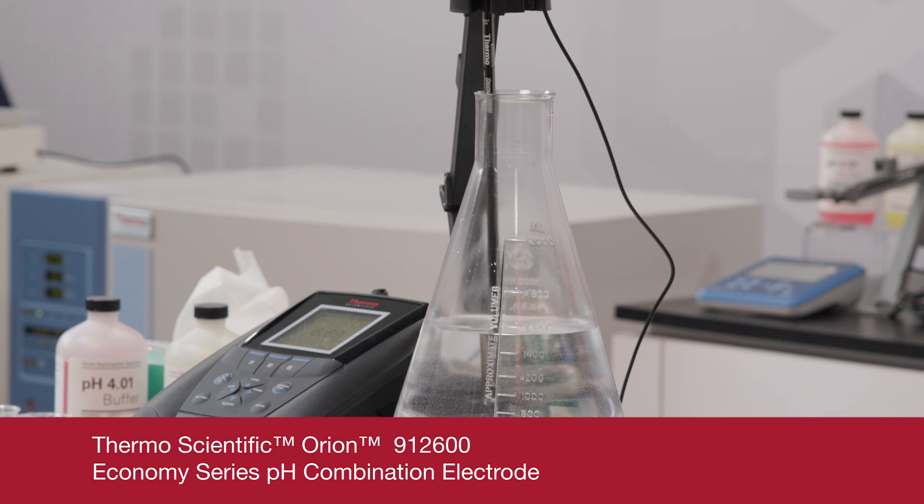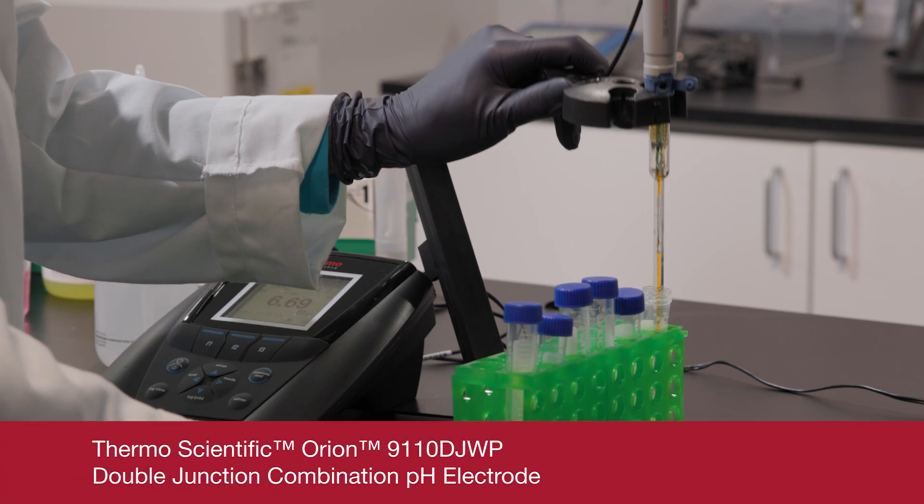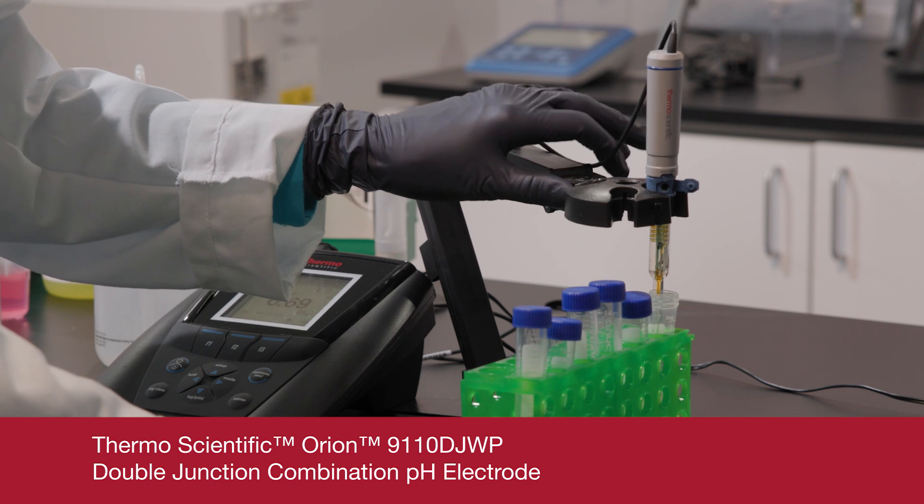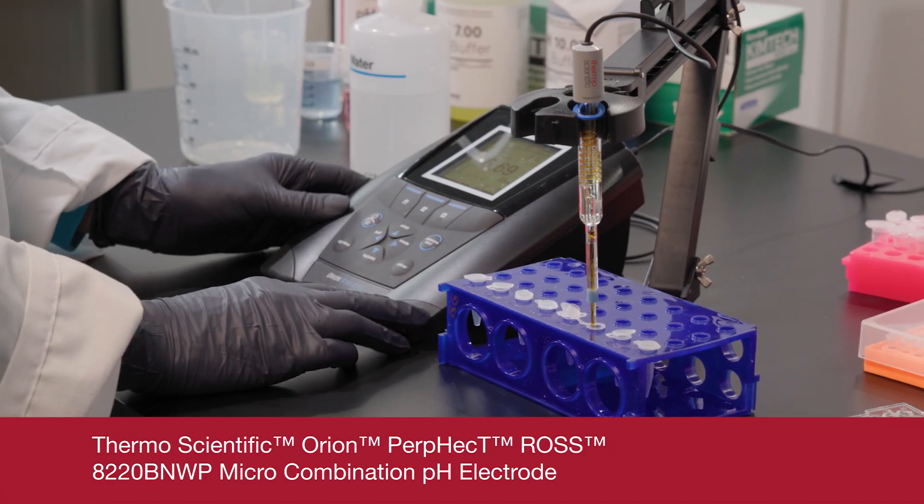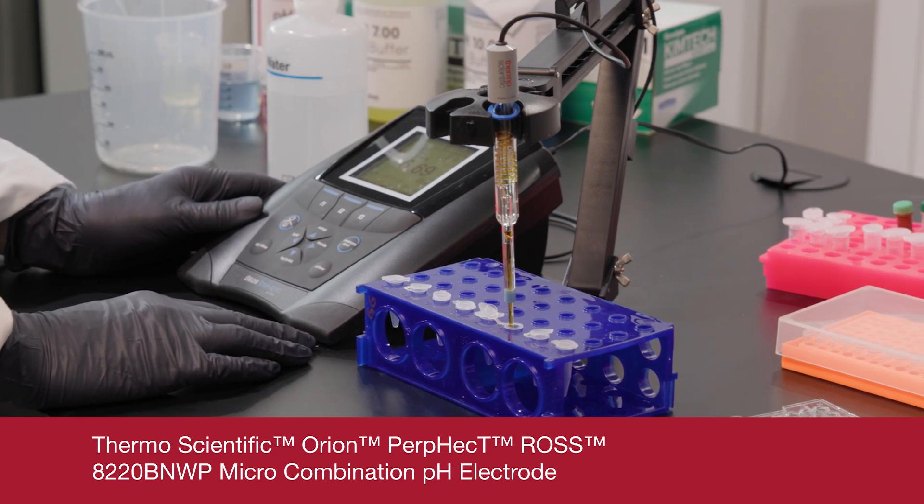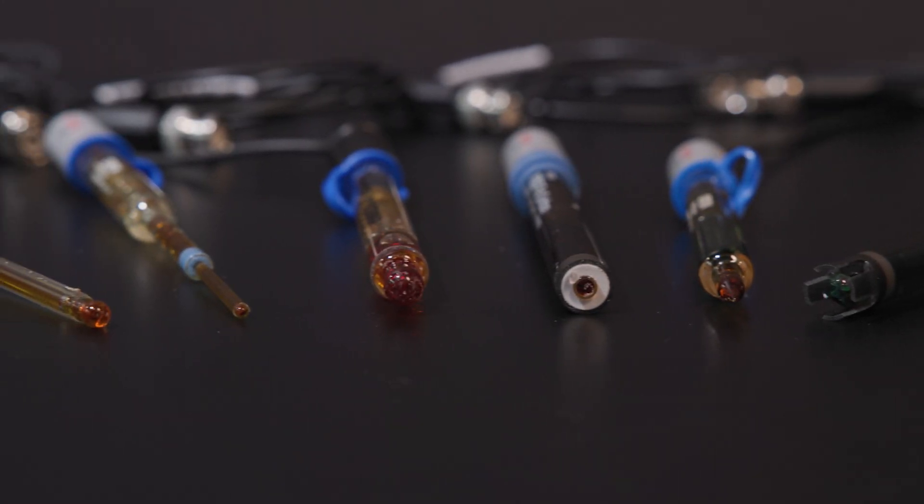Long-reach electrodes measure pH in large containers. Fin-stemmed electrodes measure pH in narrow-necked tubes. And semi-micro and micro-electrodes measure pH in small containers. You should also consider your pH sensing bulb style if you have unusual samples.